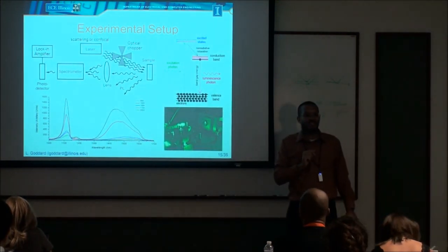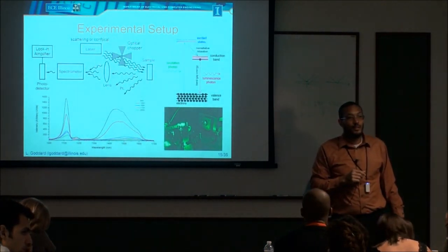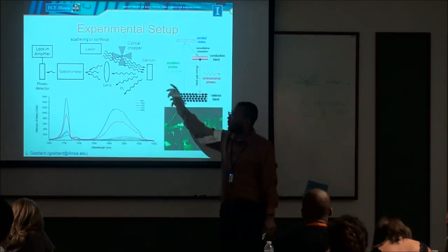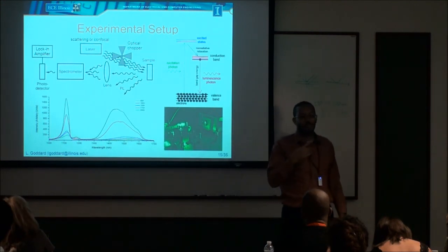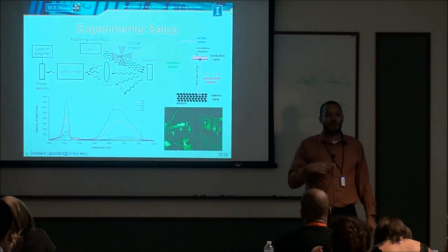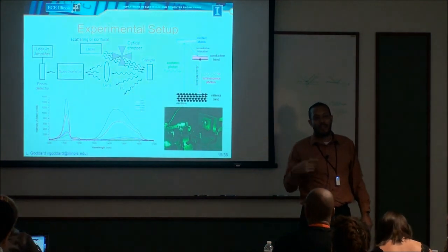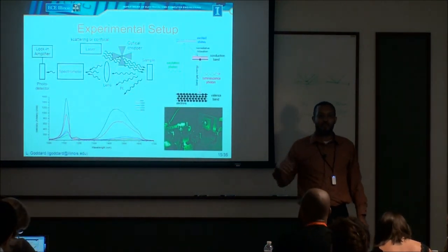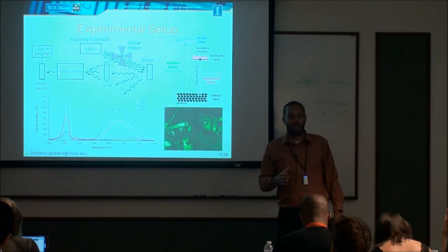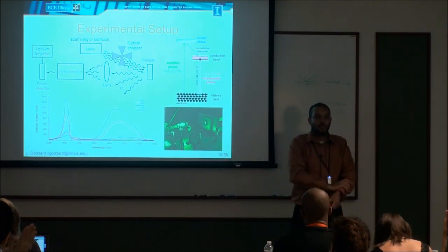Other questions? Yeah. Probably 1 kilohertz would be more common. So the trade-off, I mentioned that you can either do 1 kilohertz or 3 to 4. As you spin the chopper faster, you start to get mechanical vibration. So people avoid that based on the mechanics of it. From the electrical standpoint, higher is better than 1 kilohertz, but the mechanics of how the chopper spins gives you some additional noise. So I would say 1 kilohertz is probably your best choice for frequency.